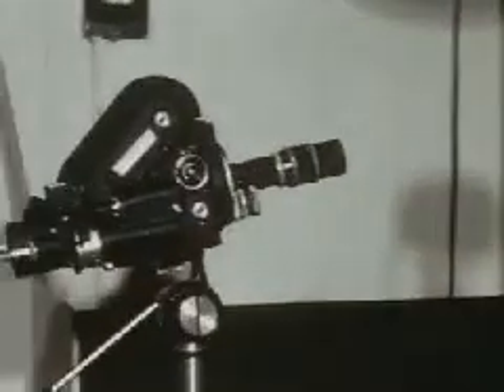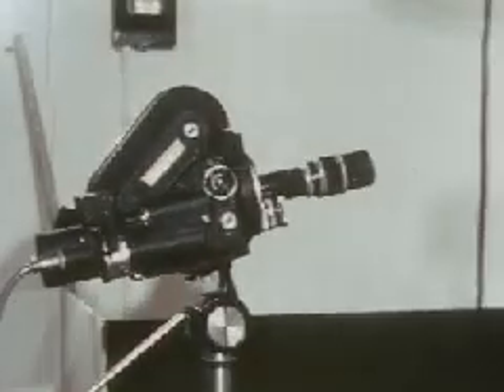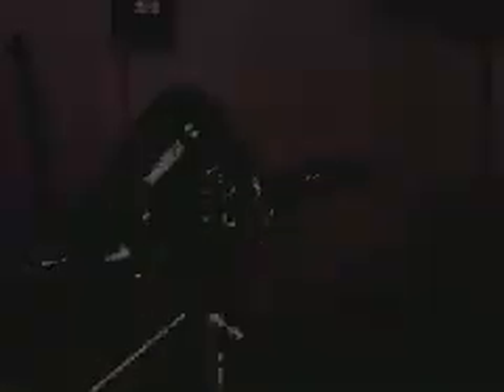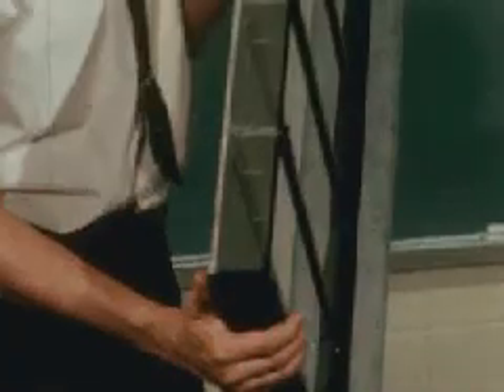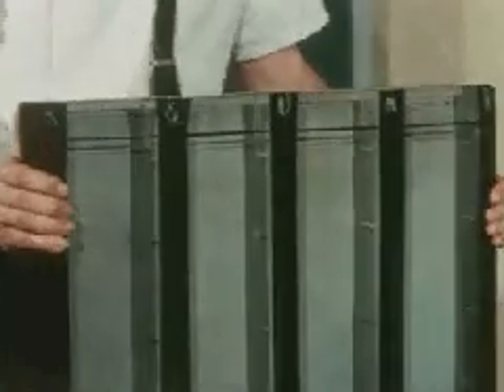The camera is attached to a timer and a relay so that a frame is taken automatically at a set time interval. The lights are turned on only when a picture is being made to avoid overheating the roots. The boxes have plastic partitions and a removable glass front. They measure 45 centimeters high and are 5 centimeters deep.